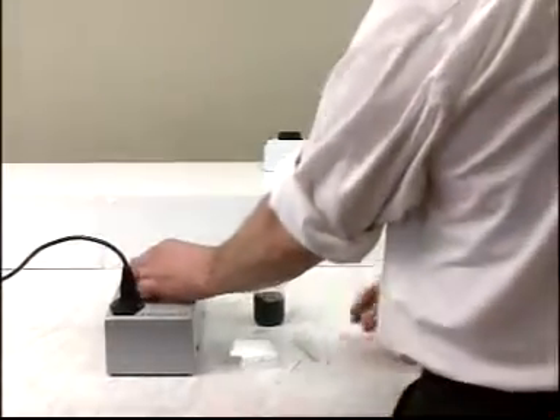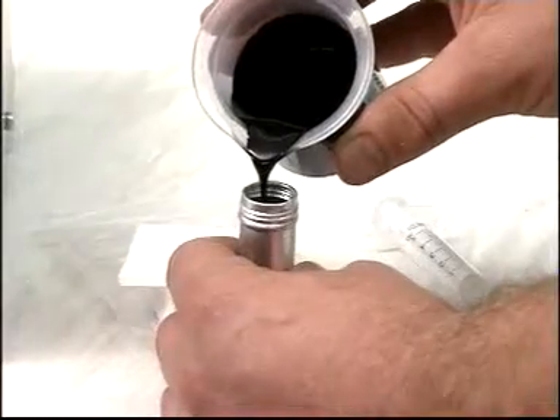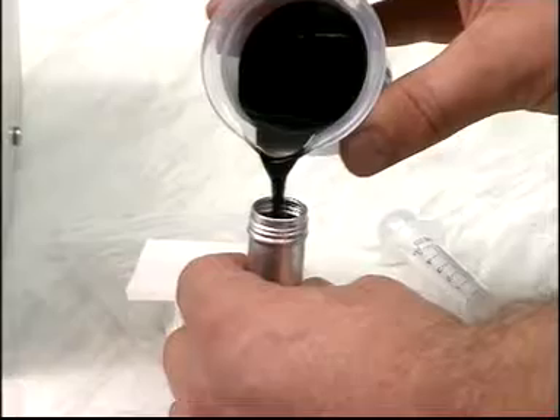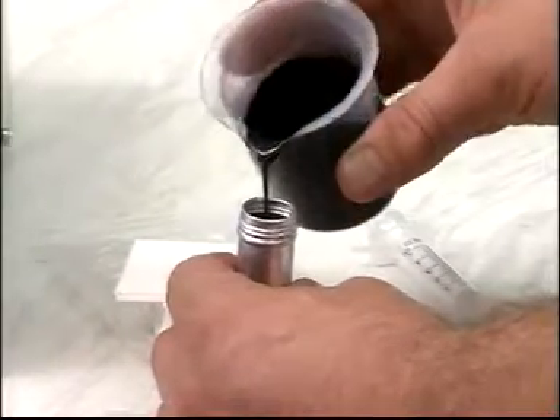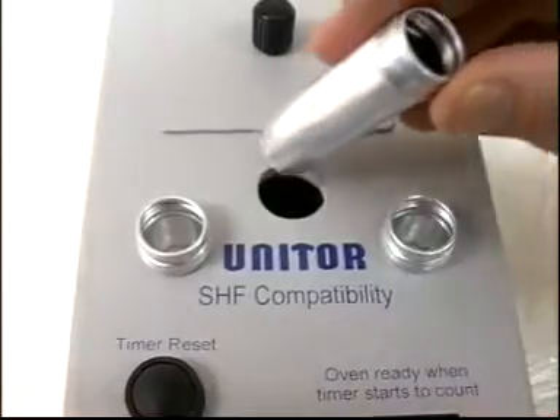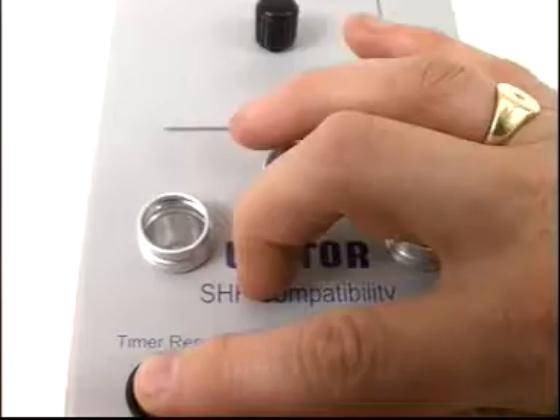Shake a representative sample thoroughly just before testing. Heat to aid pouring if necessary. Begin by testing for stability: pour a sample of oil into a beaker, then pour about 10 milliliters of oil into the sample tube. It will fill to a height of around 30 millimeters.